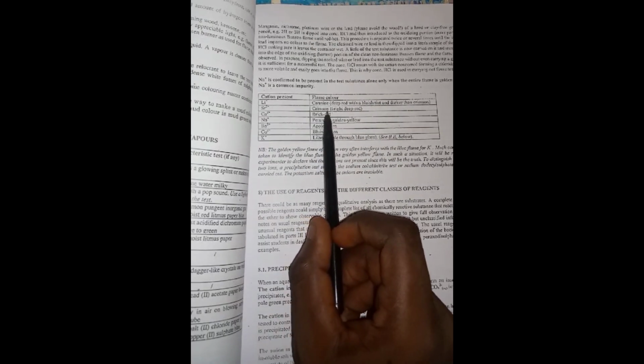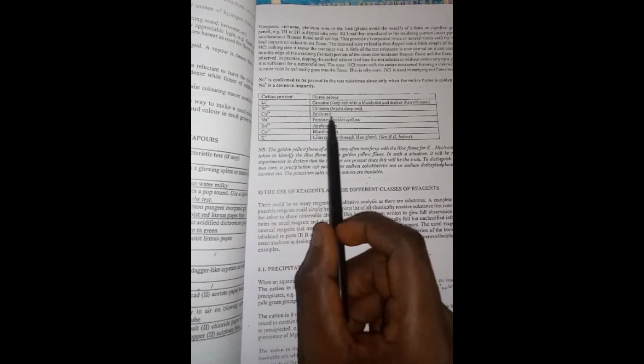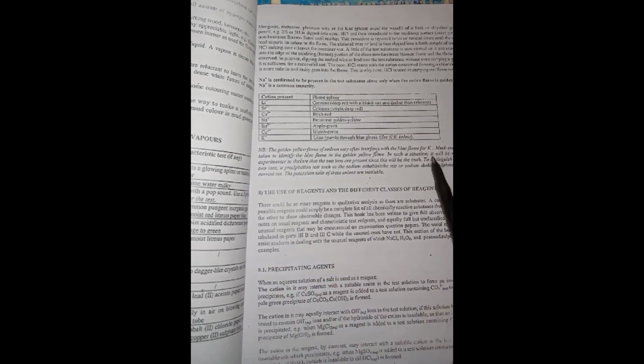Then the color is crimson. In bracket you have bright deep red. Then you have calcium 2 plus, you have brick red, you have sodium plus, which is persistent golden yellow, you have barium 2 plus, which is apple green, copper 2 plus, you have bluish green, potassium plus, you have lilac or purple through blue glass, and so on and so forth.